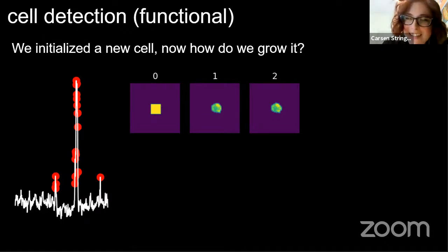But okay. So another question from YouTube: can we get the traces from silent cells too, or Suite2P only catches the active ones? I'm asking like this because if you do neural inhibition studies, one would like to show these traces as well. Yeah, so that's a good question.